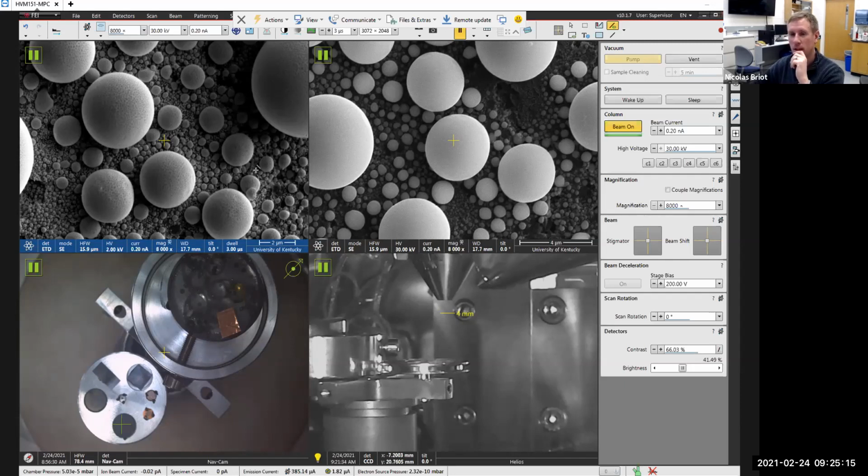Well, two reasons. The first reason is that higher energy means shorter wavelength of the signal, and shorter wavelength means you can see smaller stuff. So at 30 kV, at the maximum energy, you can distinguish, or you can differentiate smaller objects than at 1 or 2 kilovolts. So that's reason one, which makes it a trade-off.